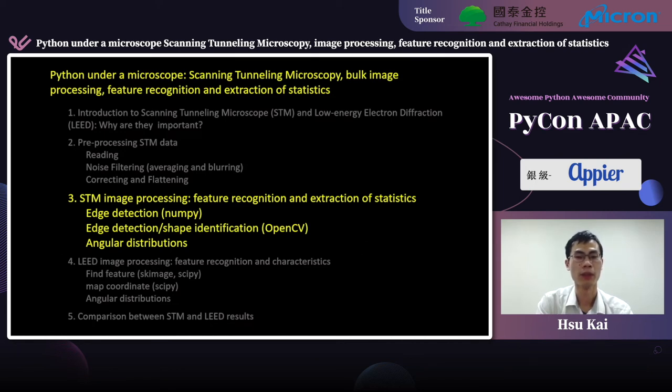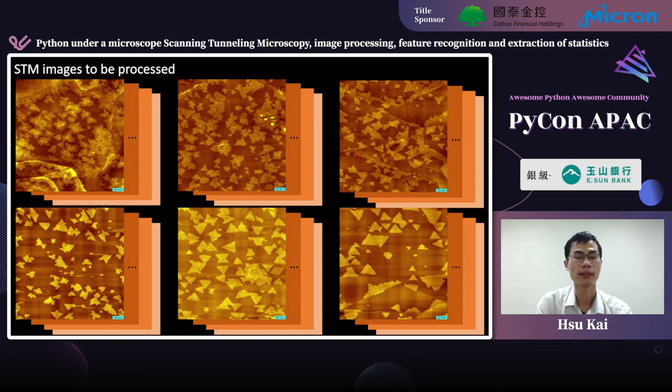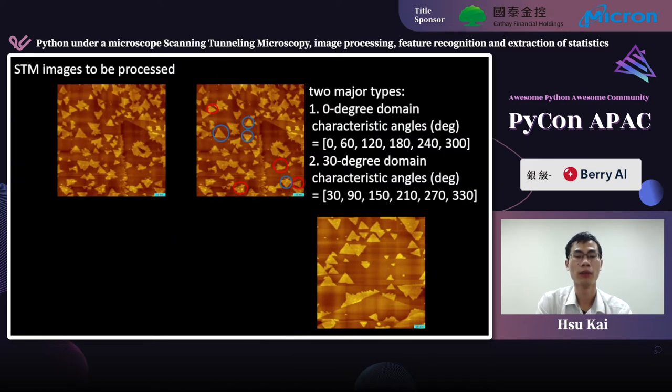Okay, let's move on to the next section. Feature recognition and extraction of statistics. Let's say we have a bunch of STM data, which is often the real case and which is why we need a systematic method to do data analysis. We have a bunch of STM data, and within each of them, there are some flakes or islands in it. Although there could be several distinct patterns, for our purpose here, I'll just focus on two major types: triangular islands pointing up and down, and triangular islands pointing left and right.